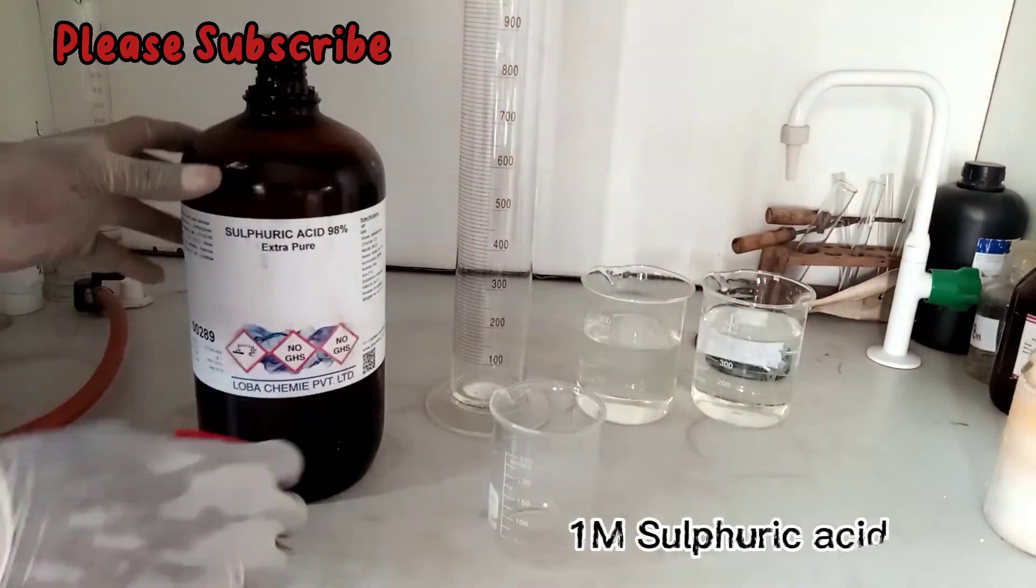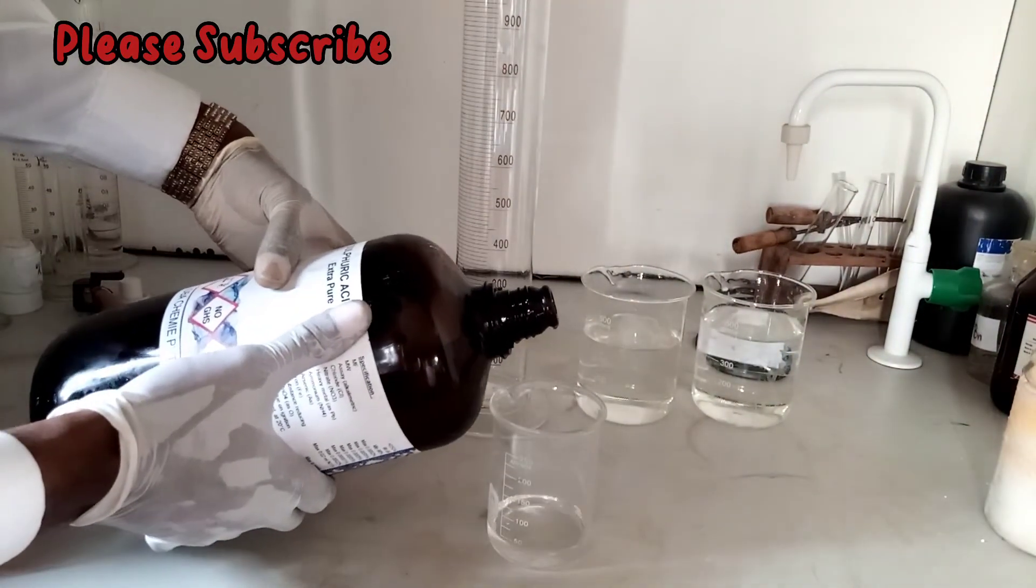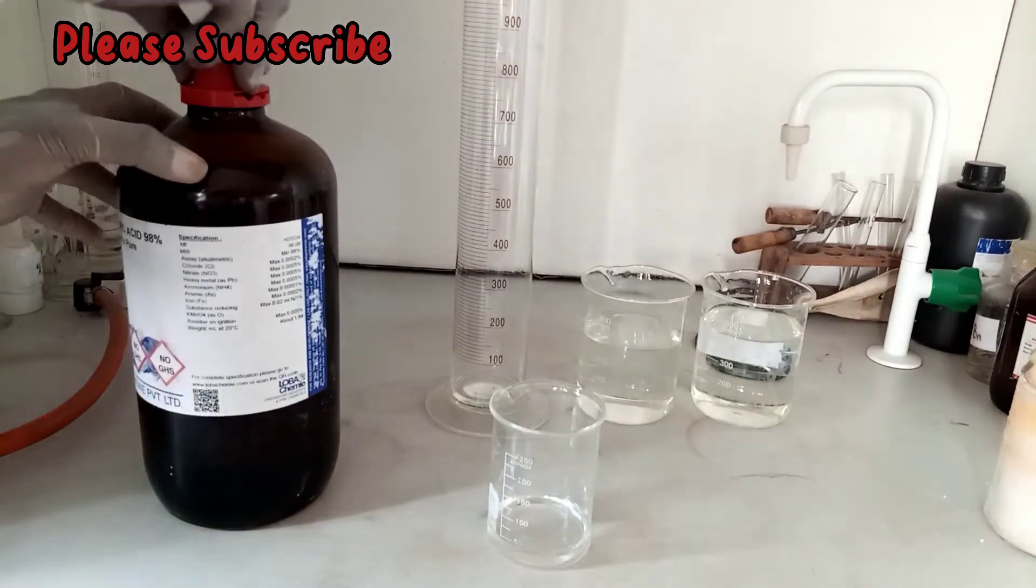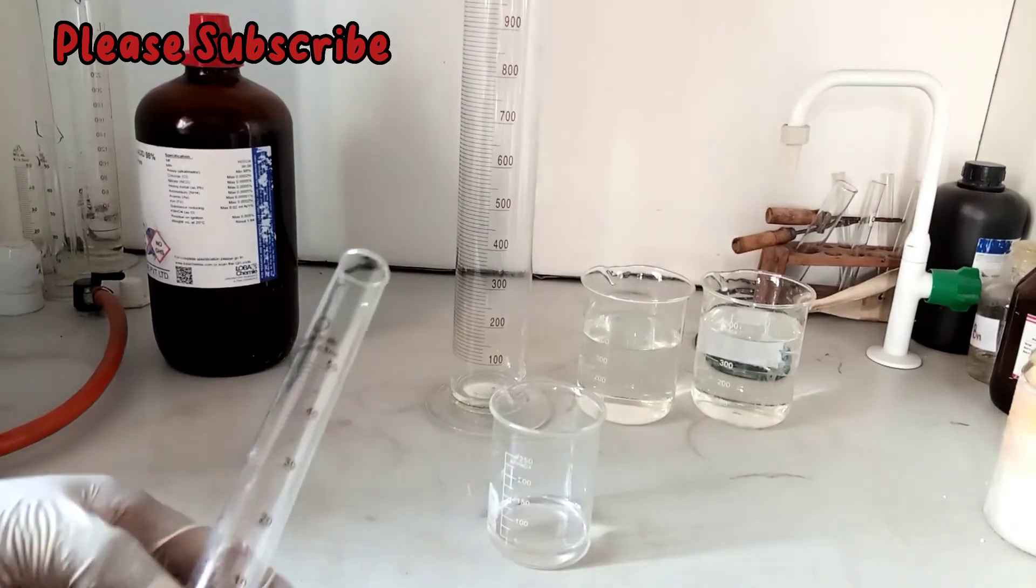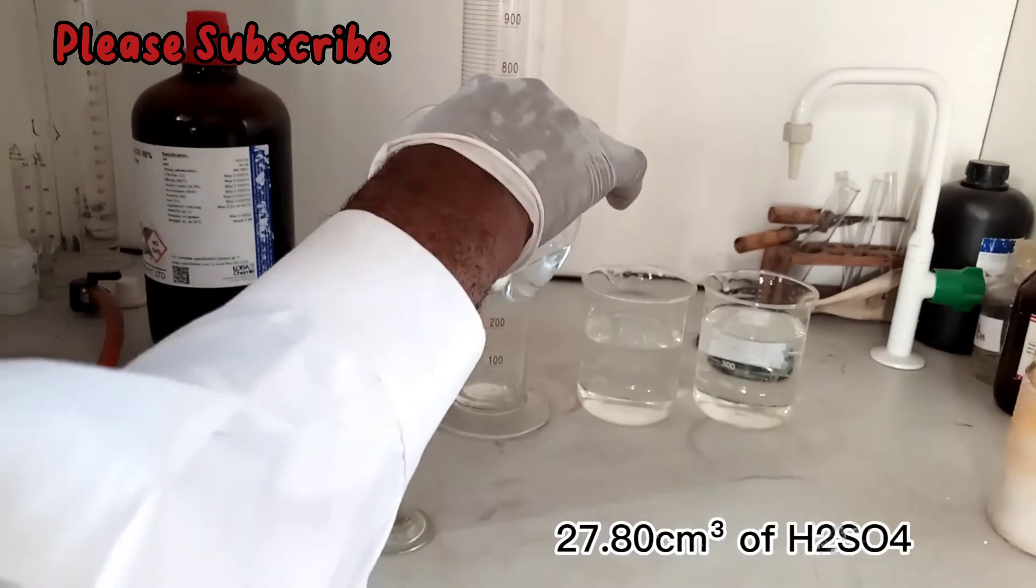To prepare one mole of sulfuric acid, you pour out little quantity from the stock solution that contains 18 molar concentration. Then here is a measuring cylinder. You measure out 27.8 cm³ of the acid.